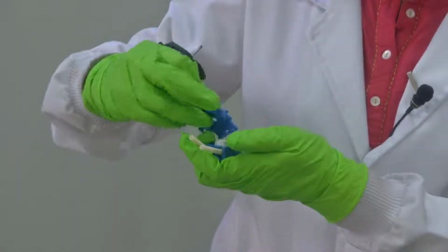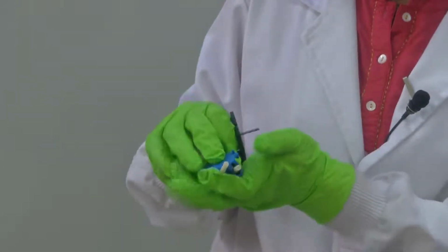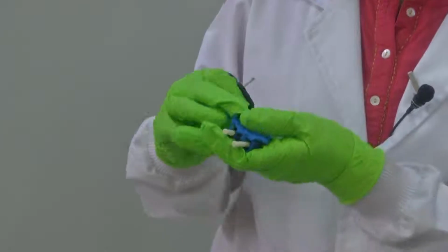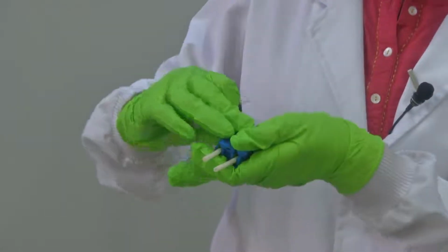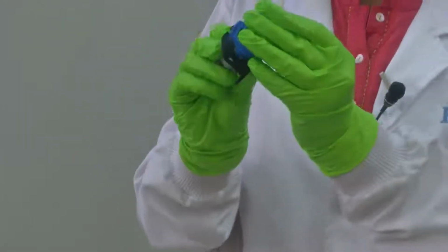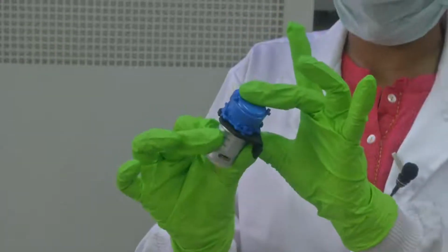And then here is the outer casing. So this forms your peristaltic pump.